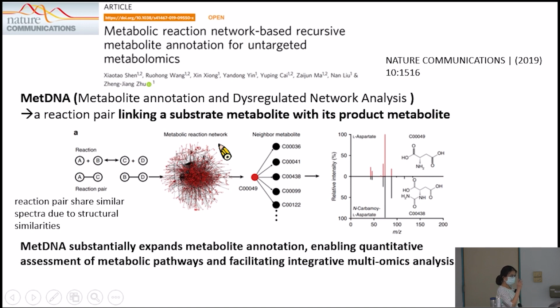I think that a single compound still has multiple components inside. A single compound doesn't mean that it has only one unit inside. They try to validate each of the components inside at different time courses, which we call retention time, and then detect at each retention time what the mass to charge ratio is.